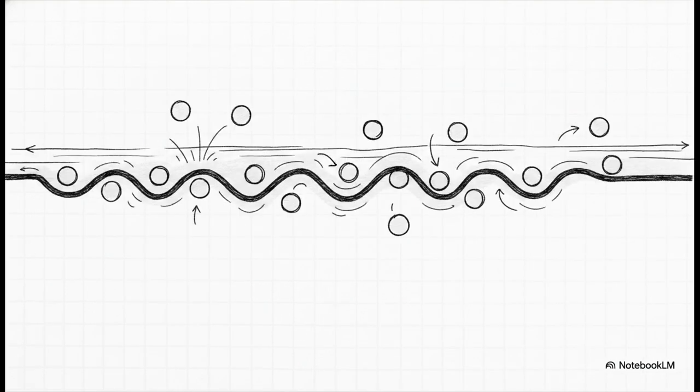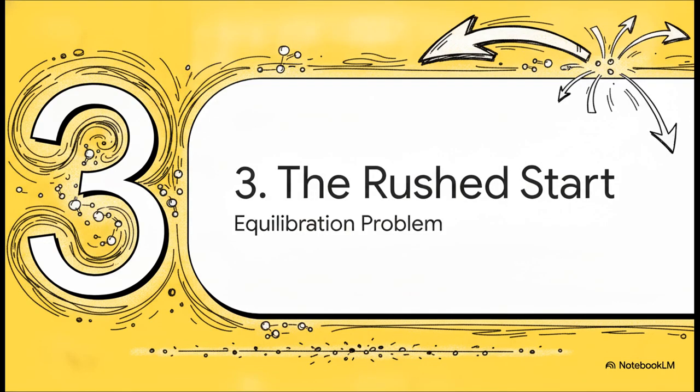Now, just like in HPLC, the actual migration is a rapid-fire sequence of adsorptions to the solid surface and desorptions back into the liquid. It's a chaotic dance. But in TLC, this dance is governed by three specific, highly complex phenomena that are entirely unique to this open, three-phase setup.